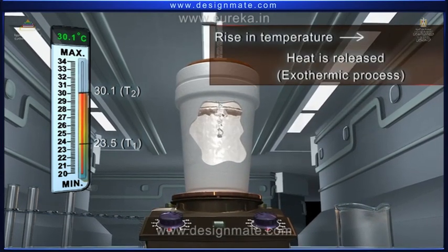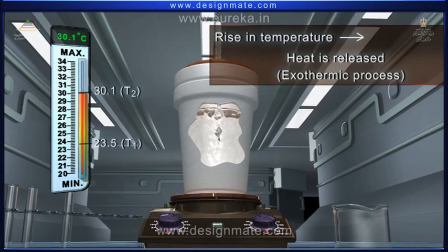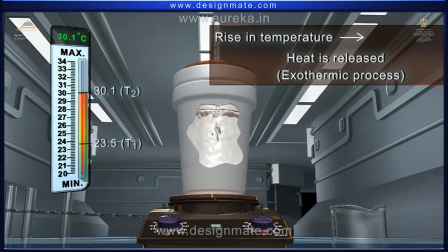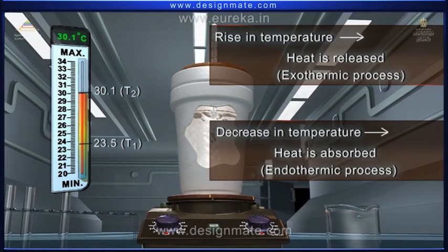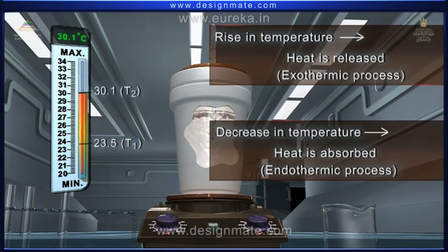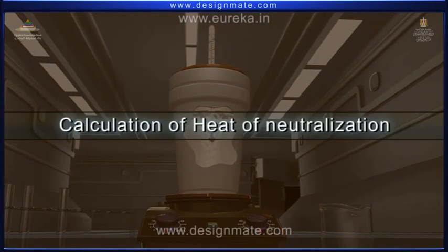Rise in temperature indicates that some amount of energy is released during the reaction. On the contrary, decrease in temperature during any reaction indicates that some amount of energy is absorbed. Calculation of heat of neutralization.